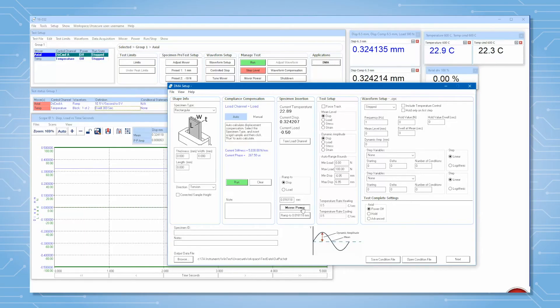Turn the power on, check the load box and press RAM 2 button to apply a small load to hold the standard block in place.